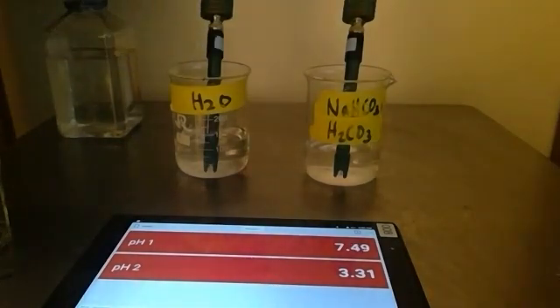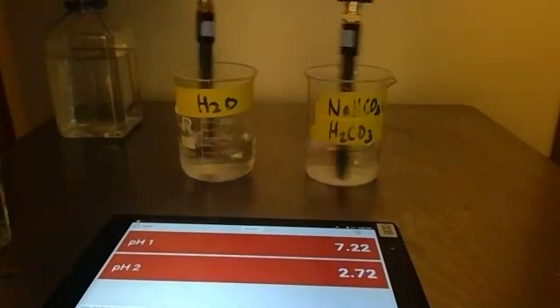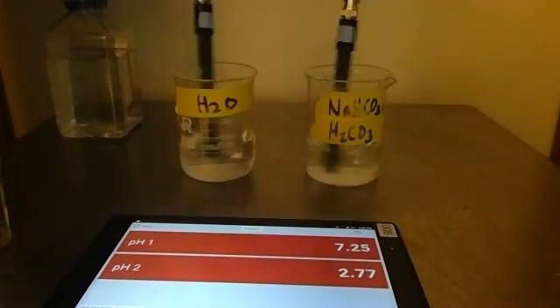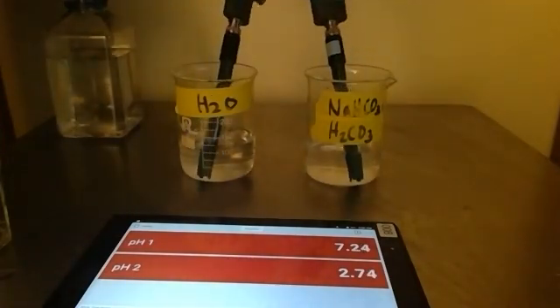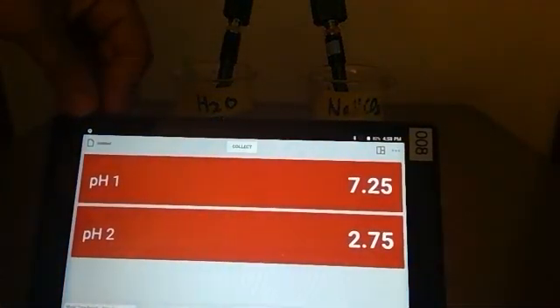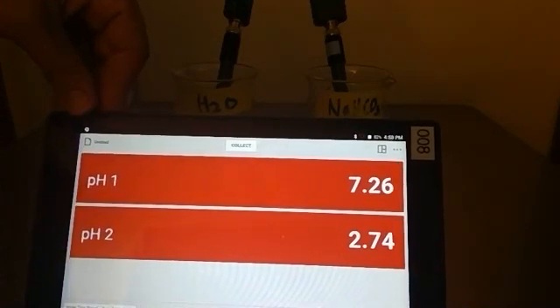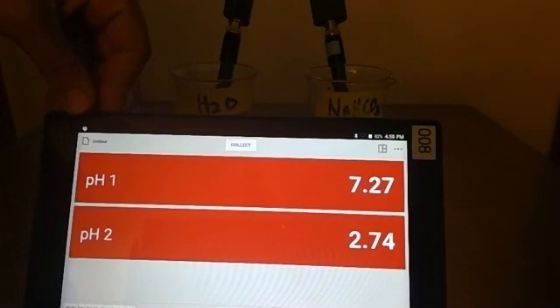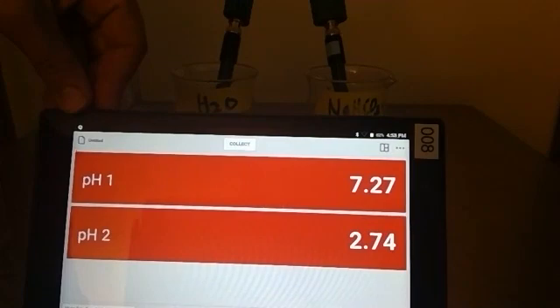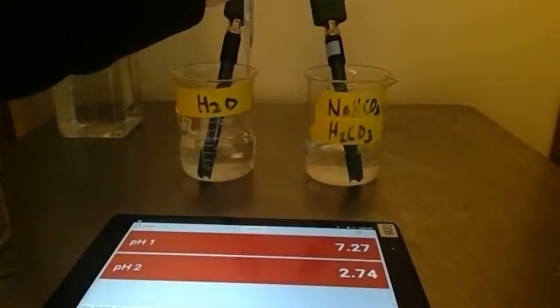Right away our buffer is resisting a change to its pH as we add this strong acid and the unbuffered solution is not. I'm adding two more drops to each of these solutions and stirring. Now our water is all the way down to 2.75. We've essentially hit the buffer capacity of water in just a few drops. Our pH for our buffer solution is 7.27 after adding four drops of our strong acid. It is maintaining its pH.